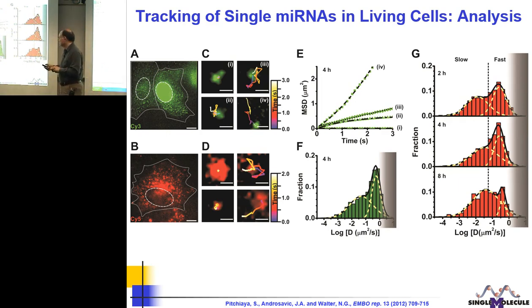So, Nils, can I ask about your very nice directed example in column 4? Is that something for these things, or is it microtubule transport? Right. So I should say we see that in about 5% or less of microRNAs. It's a relatively rare behavior, but that tracks with what people see with messenger RNAs. A few percent of a messenger RNA at any given time in a cell is actually transported in a directed fashion, like a garden variety messenger RNA.